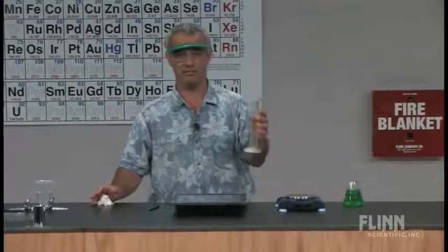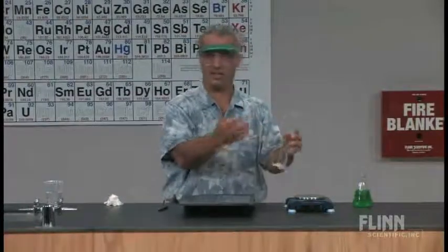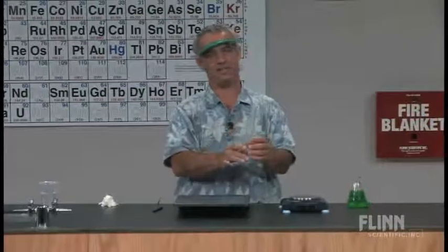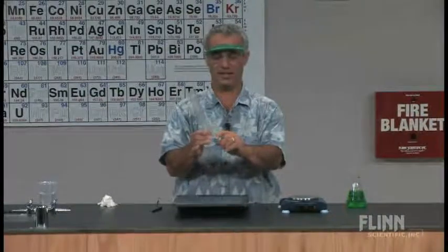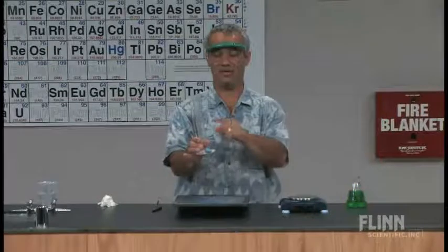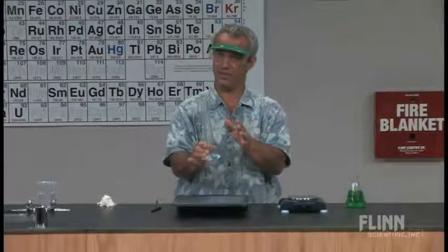Here's the trick on this. They've just done some density calculations, maybe even did a lab activity where they weighed an empty graduated cylinder, put a liquid in it, weighed it again, determined the density, maybe identified what the solution was. In this one, they're not allowed to weigh the empty cylinder. I've actually stuck a little piece of putty on this cylinder so that each cylinder in the classroom with a different amount of putty will have a different weight. That's their target — to figure out how much the empty cylinder weighs.